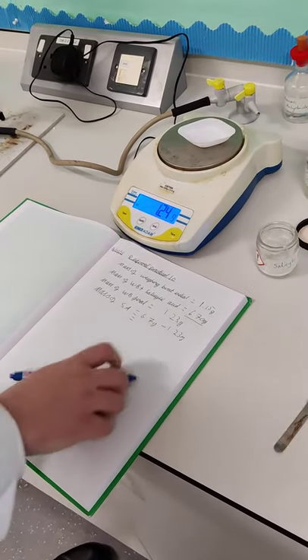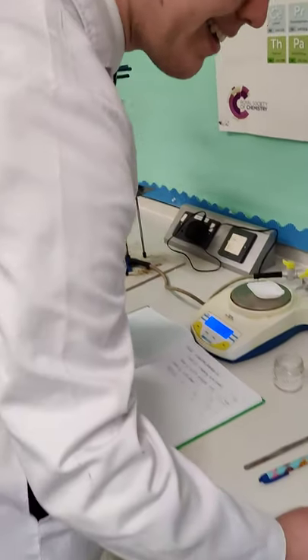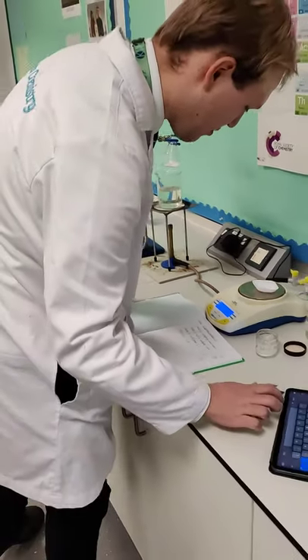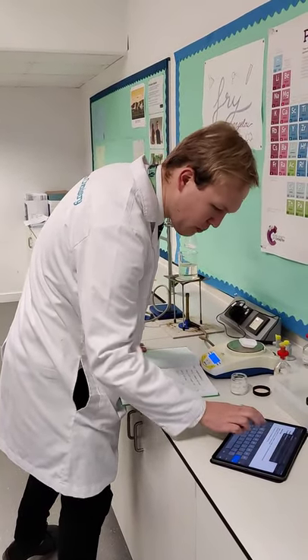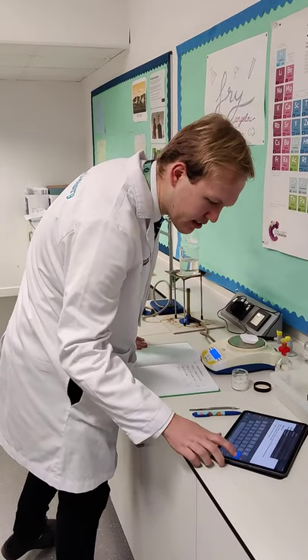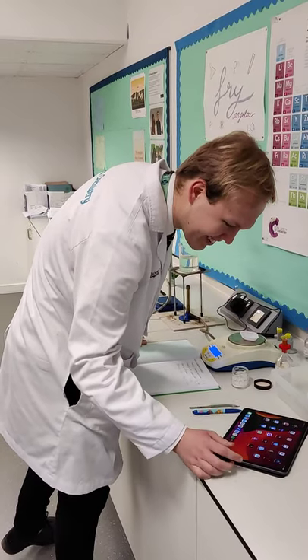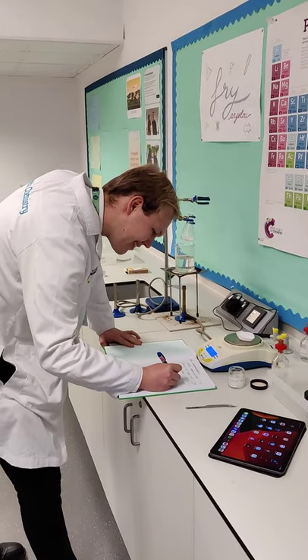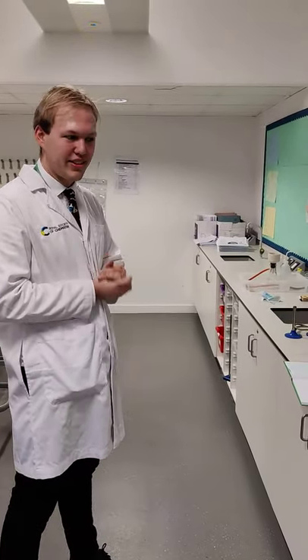We're just waiting for it to balance to get an accurate result. To find out the mass of the salicylic acid, all we have to do is take 6.70 grams minus 1.23 grams. So 6.70 minus 1.23 equals 5.47 grams. That's how much salicylic acid we have in the conical flask at the moment.